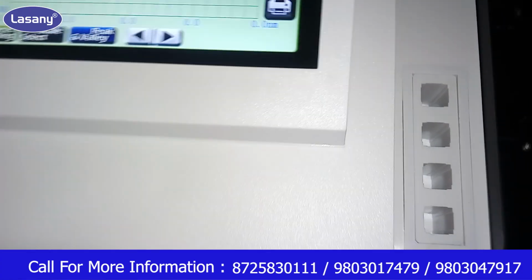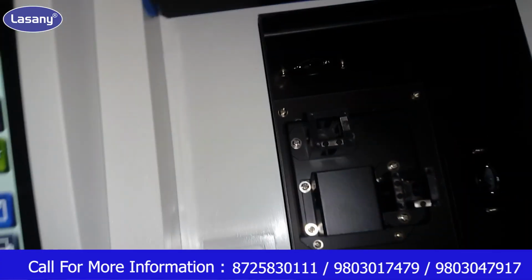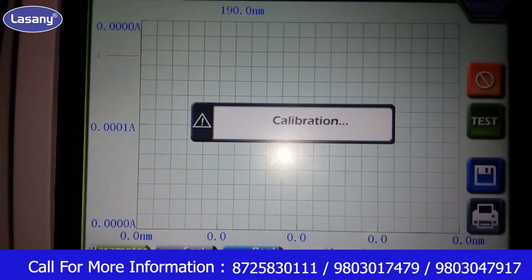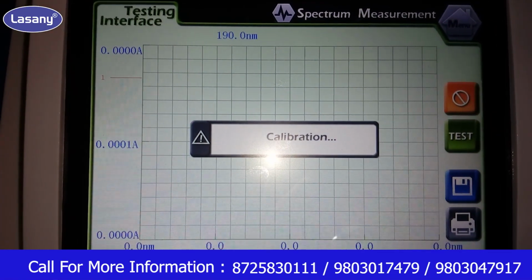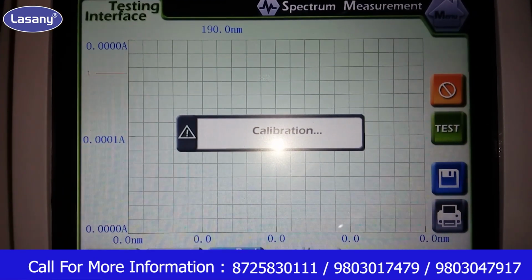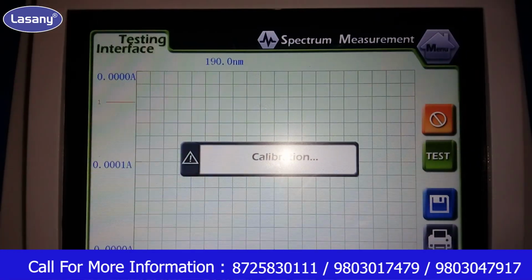Now just put your blank solution in both the cuvettes and press this baseline. It will create a baseline on the complete range, 190 to 1100 nanometers.